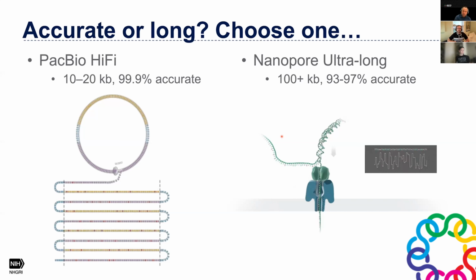They've actually had this capability for a long time. This is how IsoSeq has always worked. But the issue was those were very short, on the order of 2 or 3 kilobases long. For all PacBio sequencing, you make what they call a SMRTbell adapter, where you ligate a single-stranded adapter onto the end of your double-stranded molecule, so that the polymerase can go around this circular molecule as many times as it can, essentially until the polymerase either falls off for whatever reason, or is damaged by the laser enough that it essentially dies.